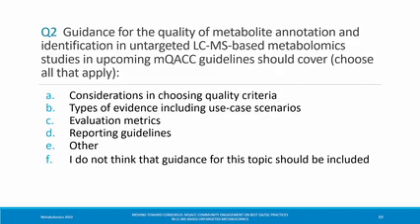Hi, I'm Pim Lennarts, Vrije Universiteit Amsterdam. I want to come back to the reference materials because, as we discussed it, it's mainly quality control. But can we not also build on annotation? A lot of people use the same reference materials, so we do our own annotations every time. Can you not build a website or whatever where we can put our annotations, so that we are building together an annotation library, more or less?